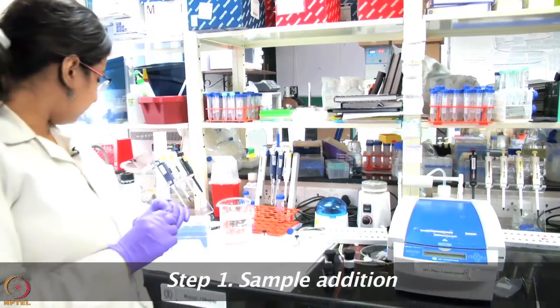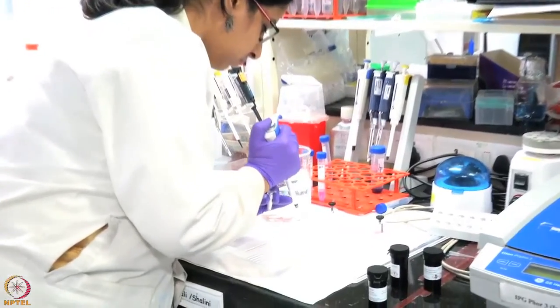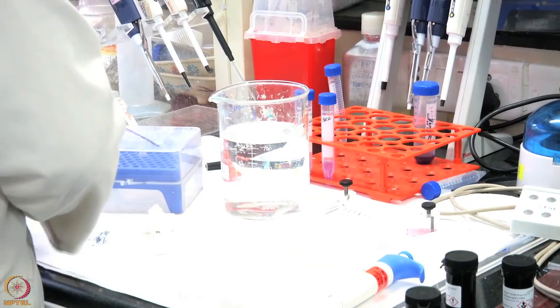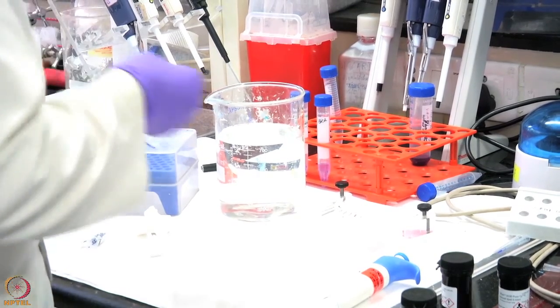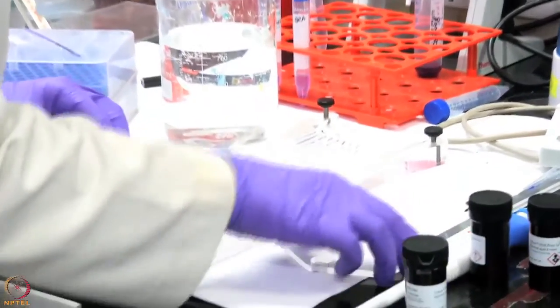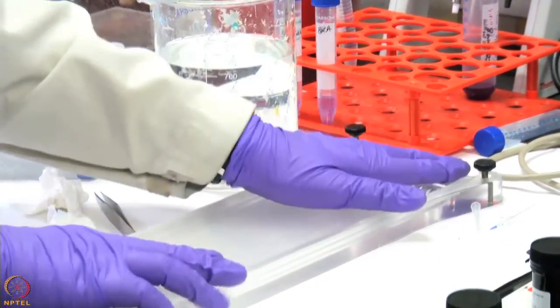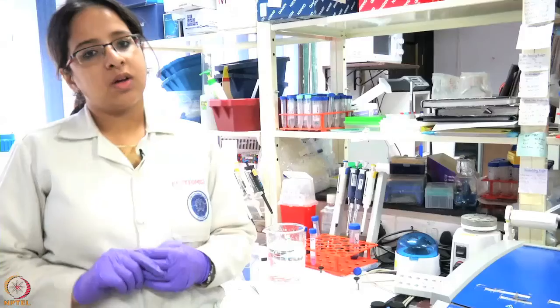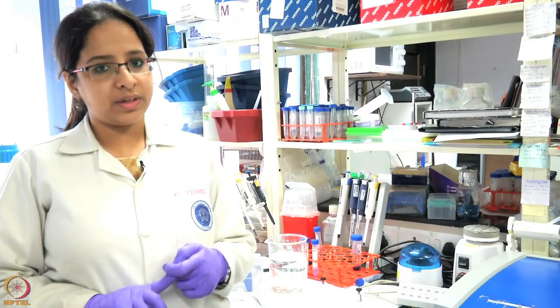So, I will take the sample for rehydration. I will add my strip, I will put a cover and then I will also put a cloth so that it remains in dark conditions and no light falls on this. So, the rest of the steps, SDS-PAGE, equilibration and separation in 2D are same.